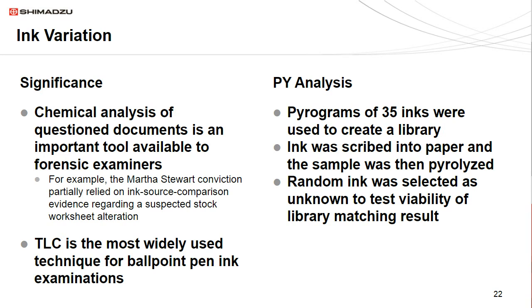So what we noticed on the previous slide was a picture of ink. Well, ink variation is actually quite significant in the field of forensics. The information from the forensics examination of inks and paper can be critical to investigations involving things like financial crimes, counterfeiting, terrorism, and anonymous letters used for threatening correspondences, ransom notes, and even kidnappings.